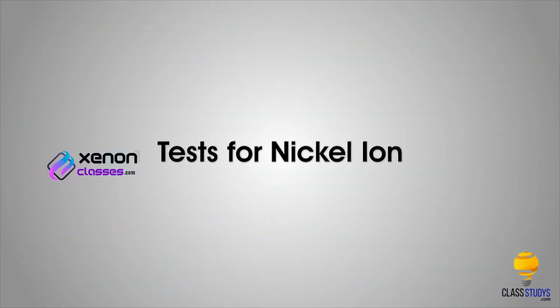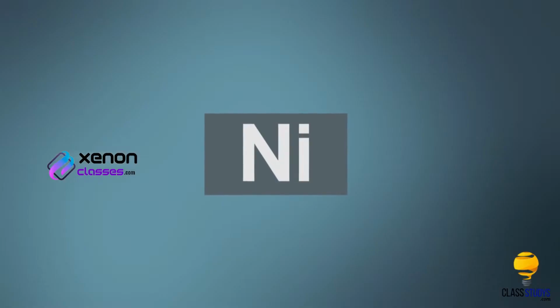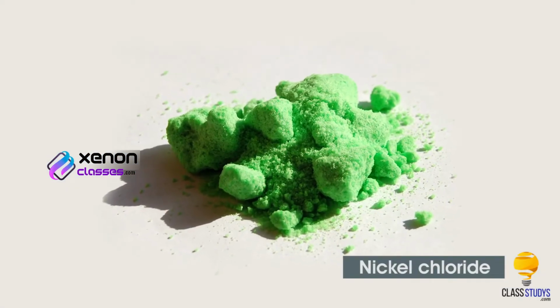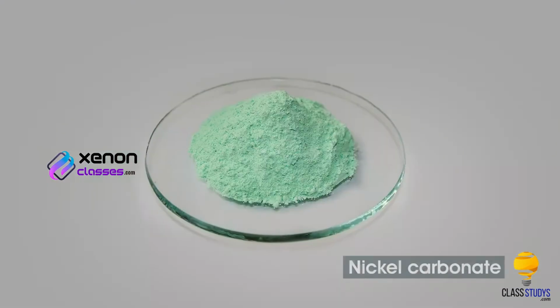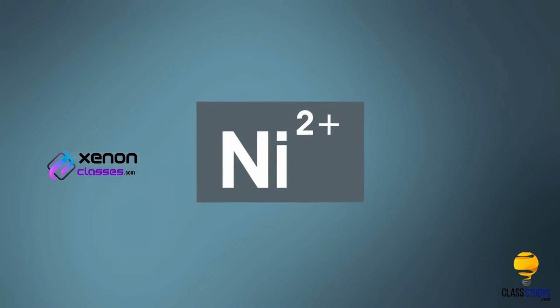Tests for nickel ion. Nickel is a chemical element with the symbol Ni. It is found in various salts like nickel chloride, nickel nitrate and nickel carbonate as nickel 2 positive ion.